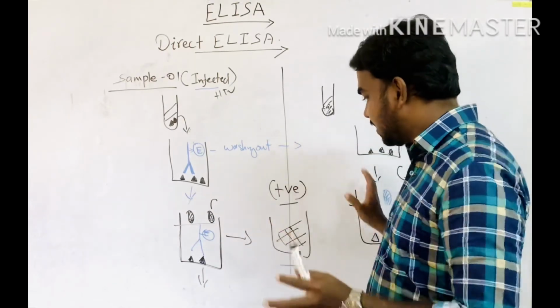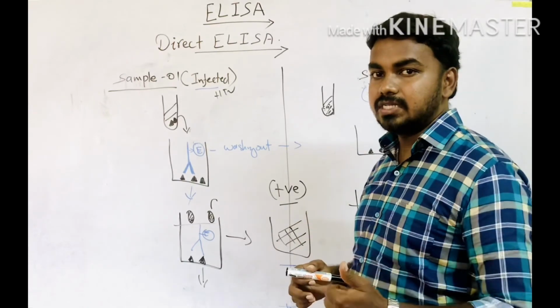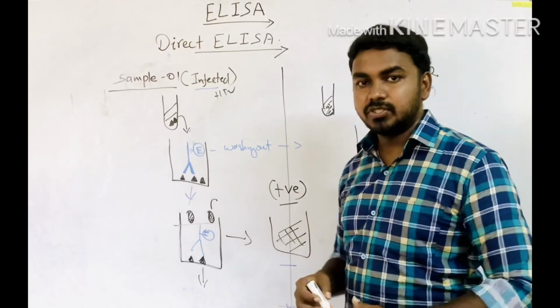So this is the basic idea of direct ELISA. So now we know indirect, direct and sandwich ELISA.